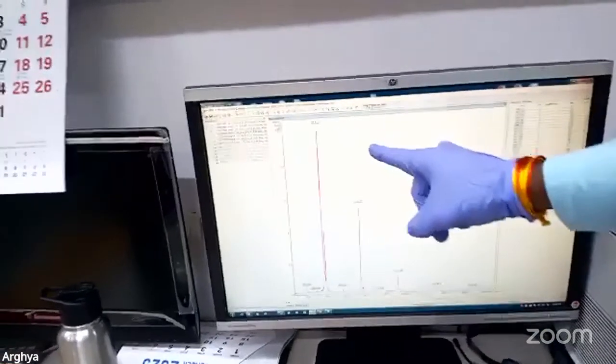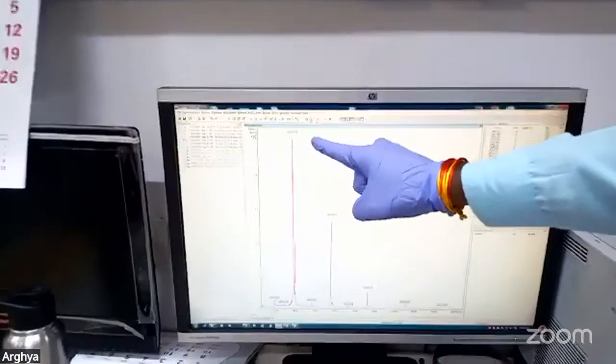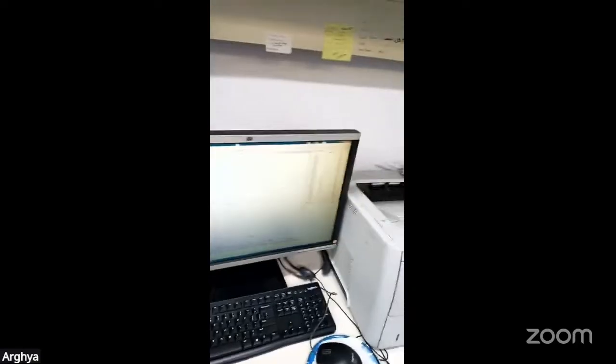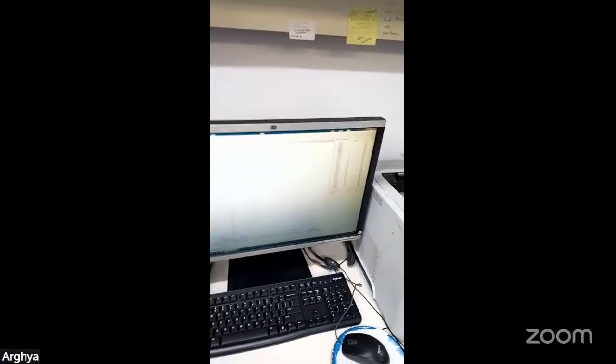So this is how the data looks like. So this is our peptide, whose exact molecular weight is 3751 Dalton, and we get exact weight 3751 Dalton in our MALDI analysis. So yeah, I hope you have seen the MALDI, and in the next set of lectures, we will tell you about the different mass specs also, and how we can develop such a robust instrument.